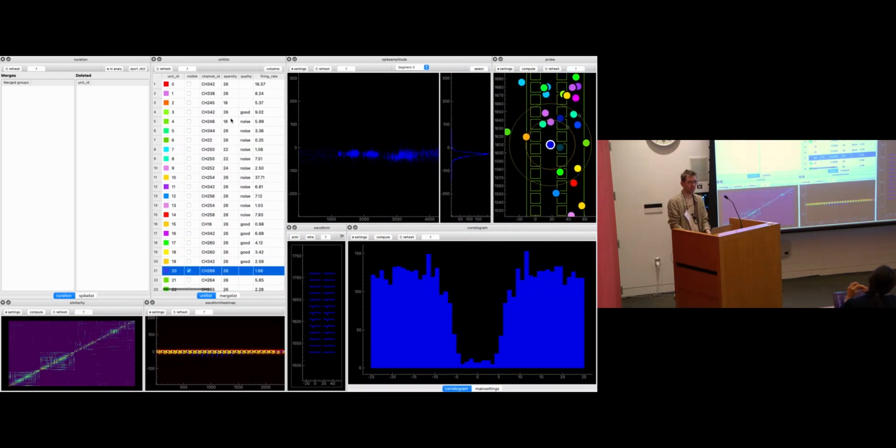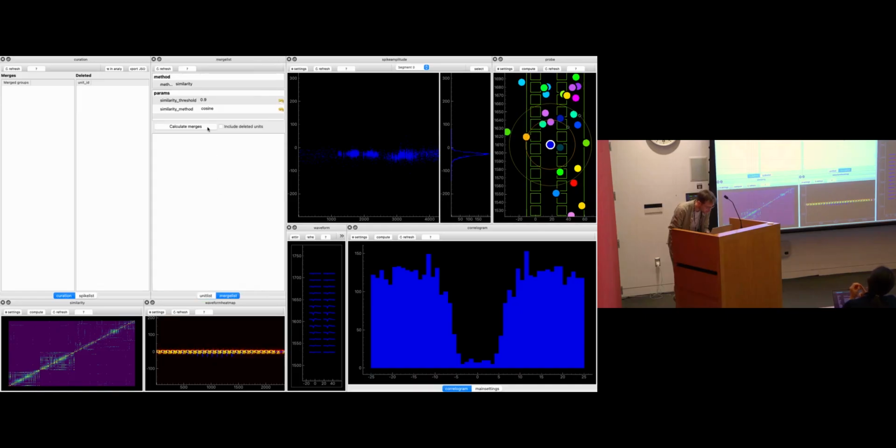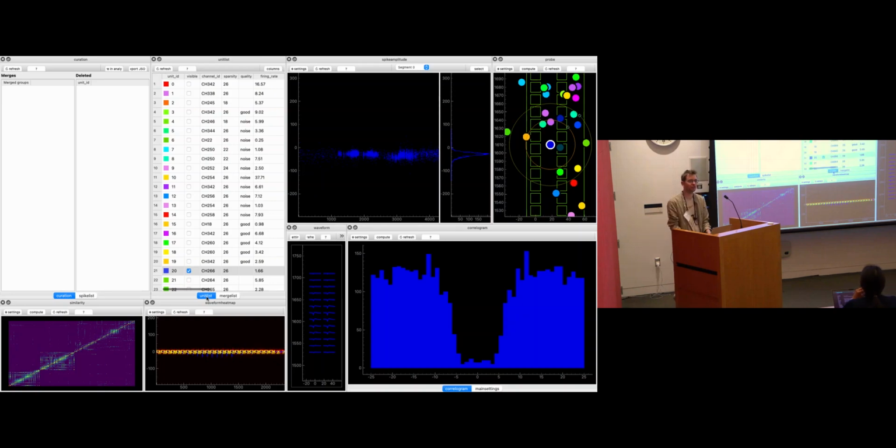The merging, there's a way where you sort by template similarity, and then you can view the 2 waveforms at once next to each other. Now the way you do that is simple, but I can't remember. Oh, merge list? Oh no, that's doing automated merging. Yeah, I've not actually worked on this at all, but it is simple.